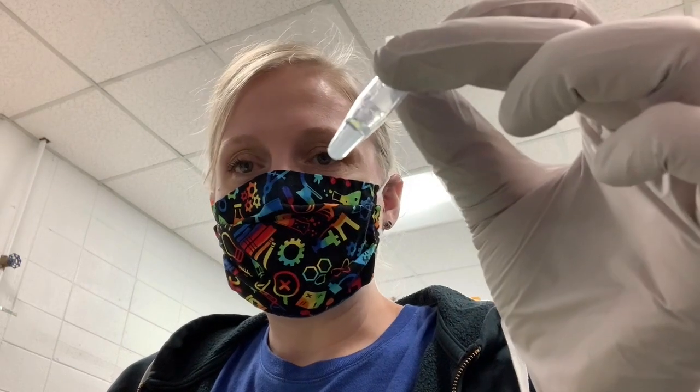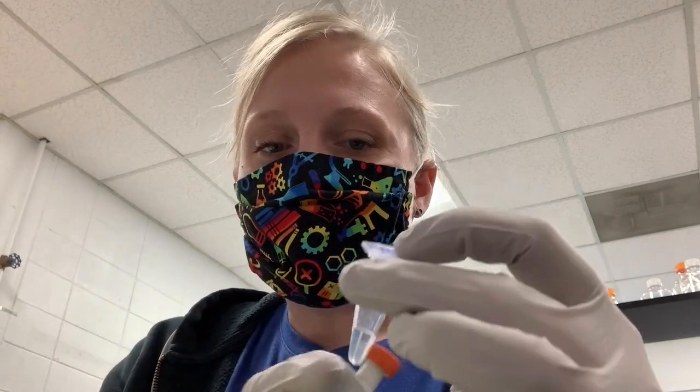I think, as I mentioned before in one of these videos, I usually add water first. If it's one of the ingredients, it usually is the primary ingredient with the highest volume, so I like to get that in there first. Next, I'm going to add the high yield transcription buffer, which was the buffer that was used for the transcription reaction. When you're thawing these buffers, make sure that they're completely thawed, there's no ice left. And if you see any little precipitate in the bottom, make sure that's totally resuspended before you proceed.